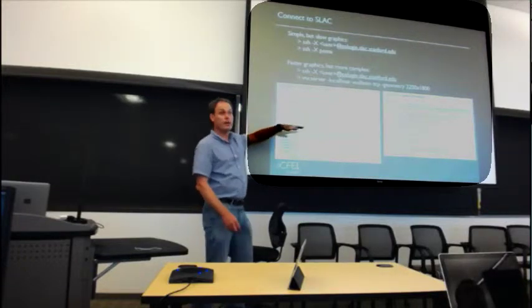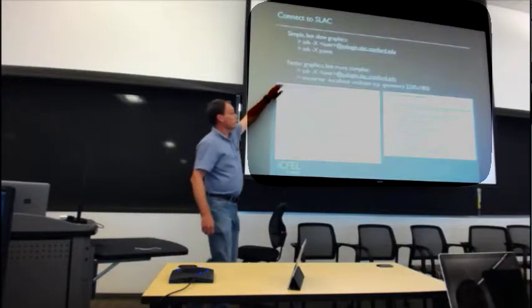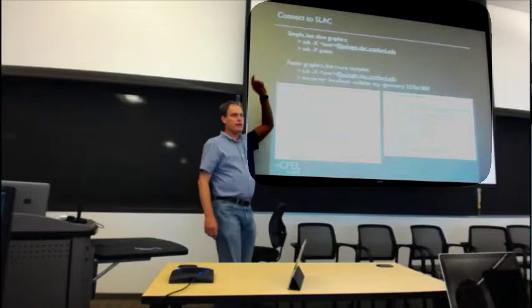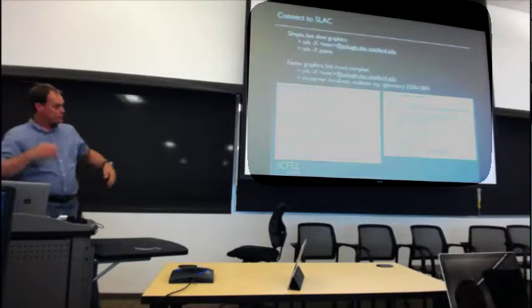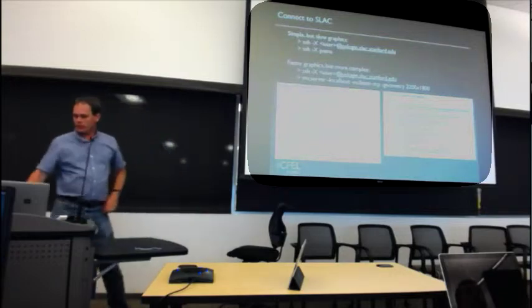If you know how to do it, great. You'll get much better feedback. Your graphics will come up much quicker. I can run this from Hamburg and it's responsive enough. If I try running the first one, it's click a button and make a cup of tea. So as Chris mentioned, using these virtual screen servers is really good because there's a graphical interface.